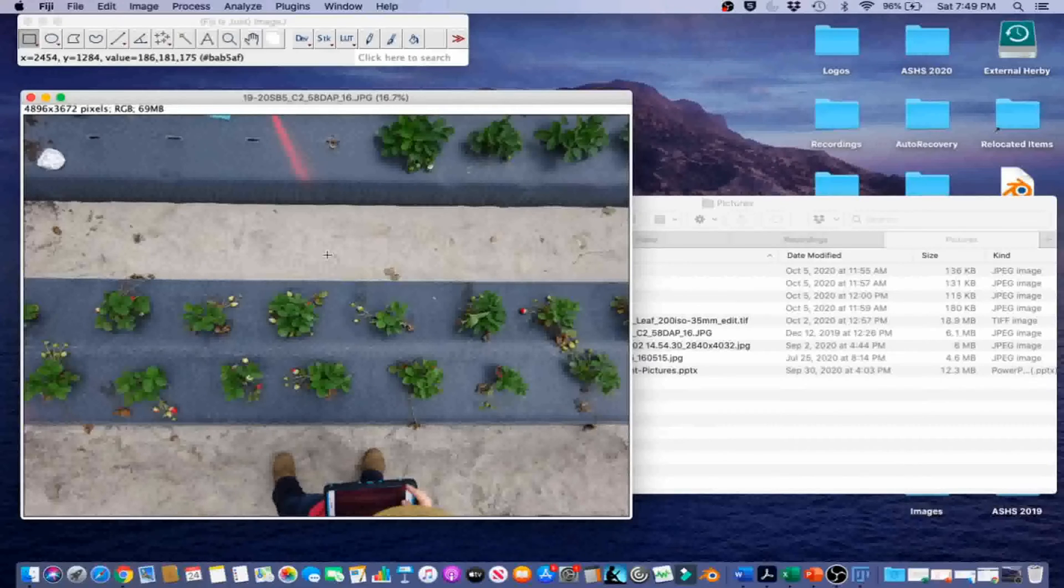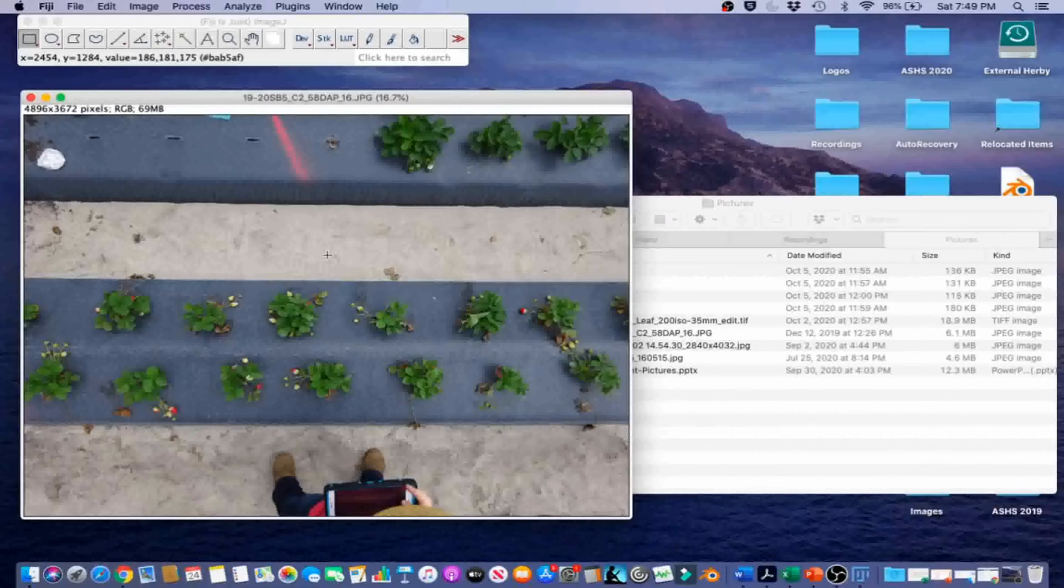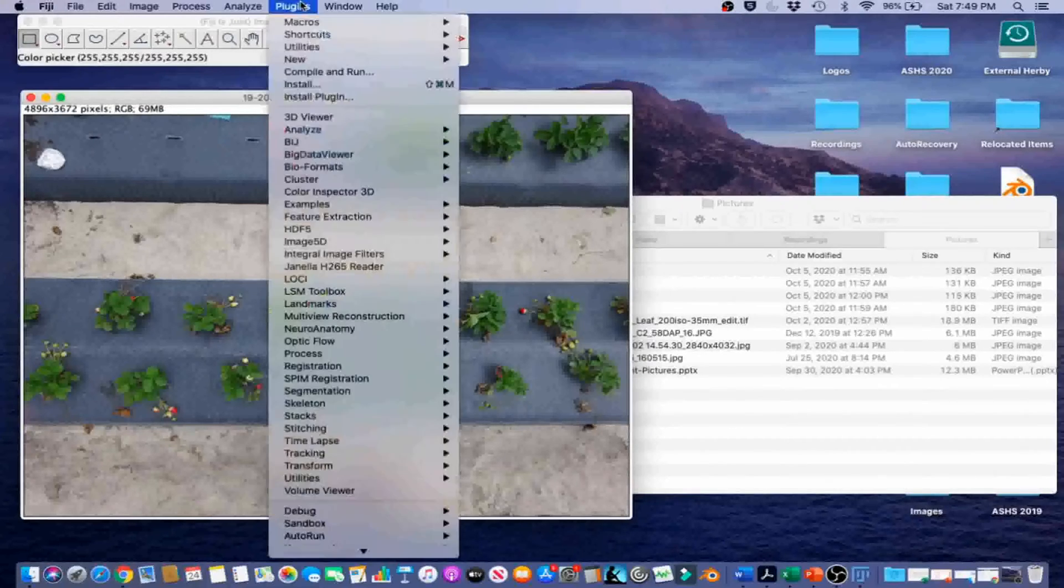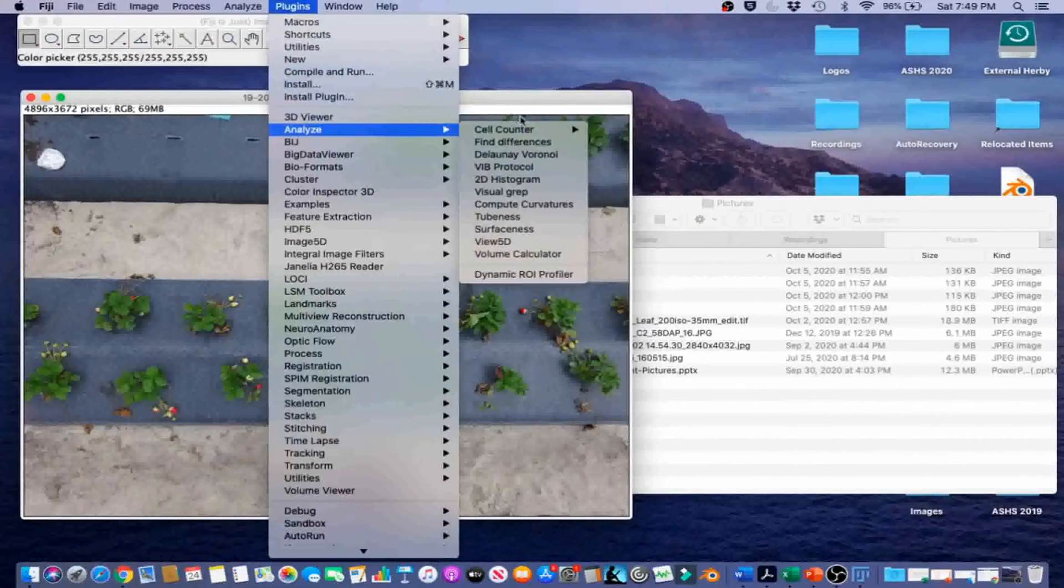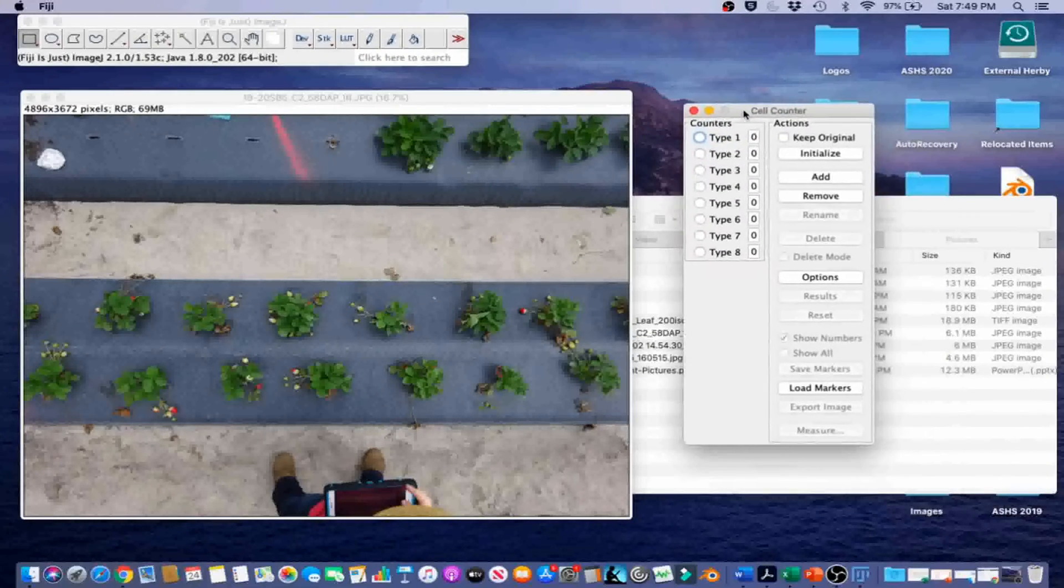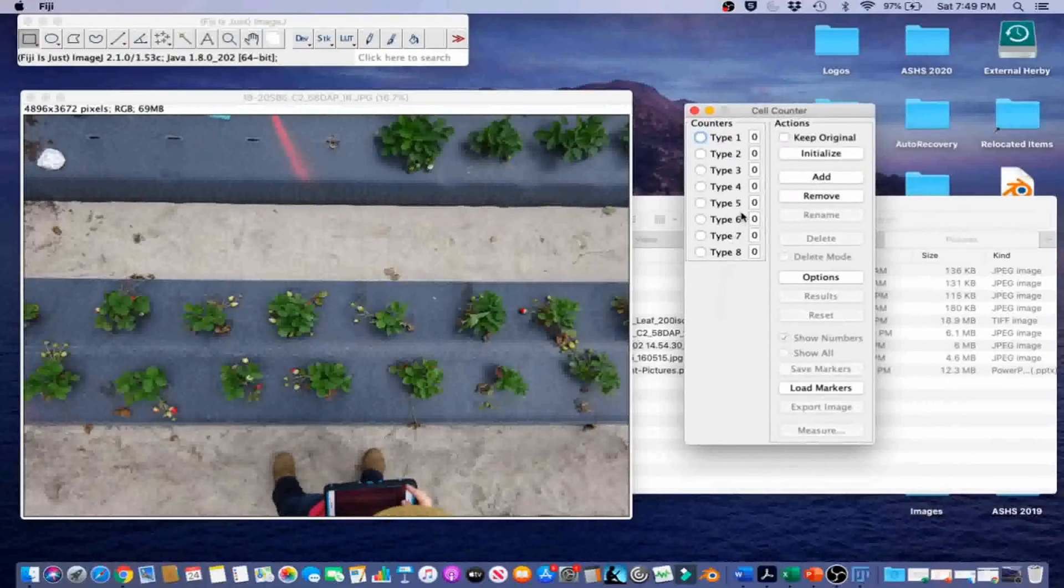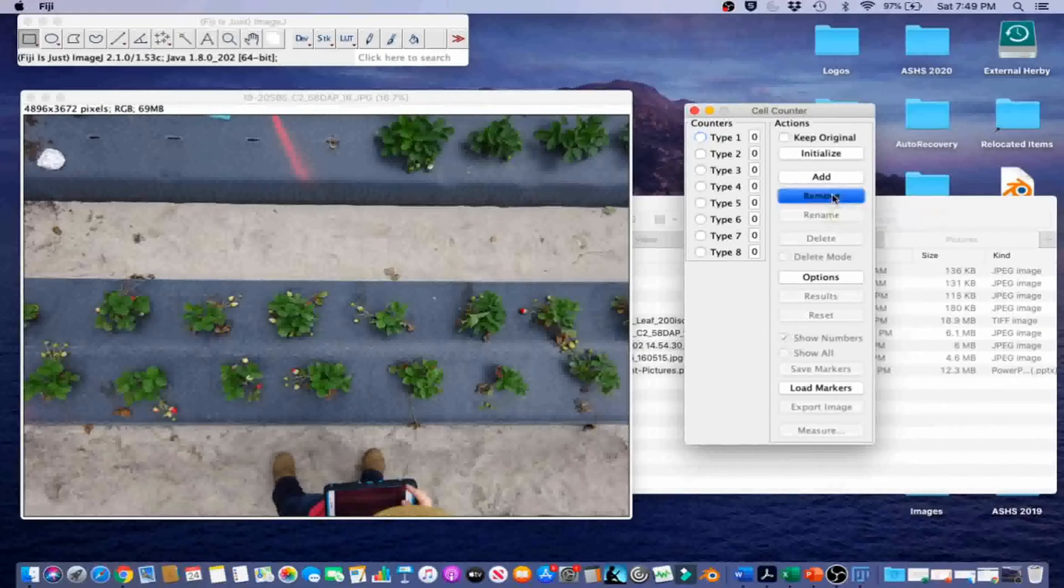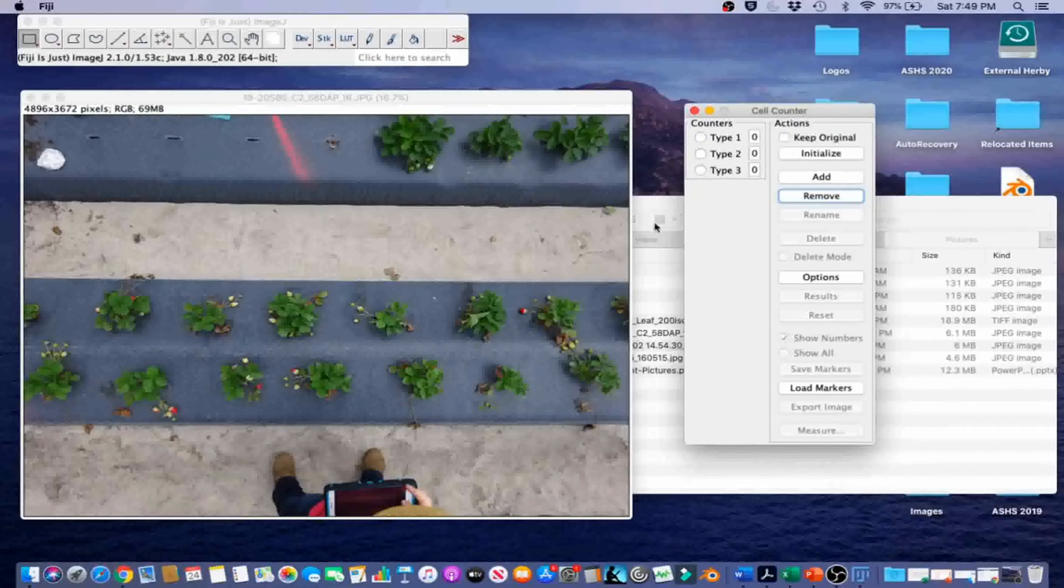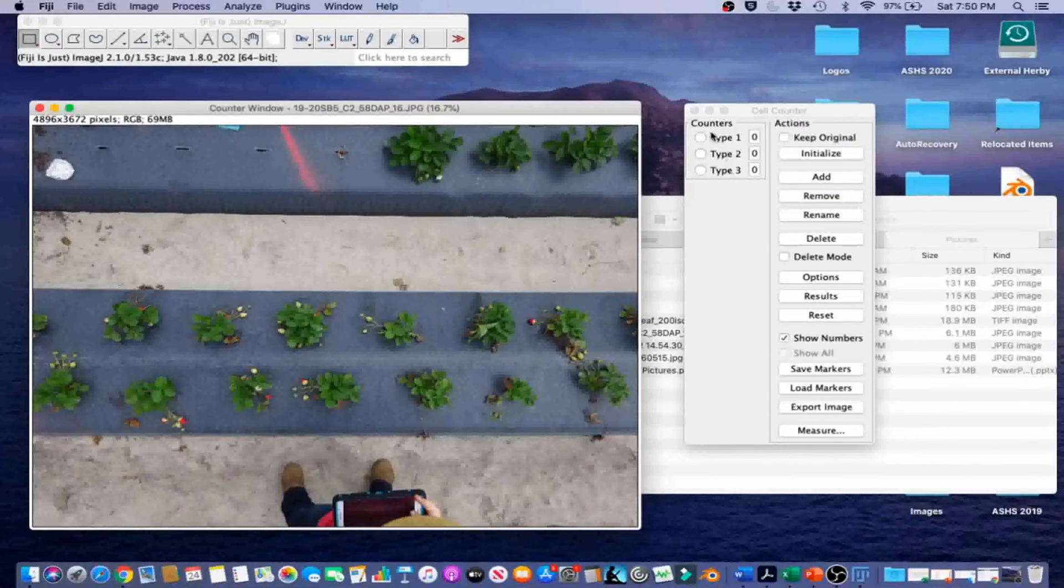In this example, we will count the number of strawberries turning red, the number of unripe white strawberries, and the number of flowers in the photograph. You will use one of Fiji's Manual Count Plugins. Go ahead and go to Plugins, Analyze, Cell Counter, Cell Counter. It's going to open up a little cell counter window. We have a lot of different counters right now, so we're just going to go ahead and click Remove a few times until we only have three. And then we're going to go ahead and click Initialize.